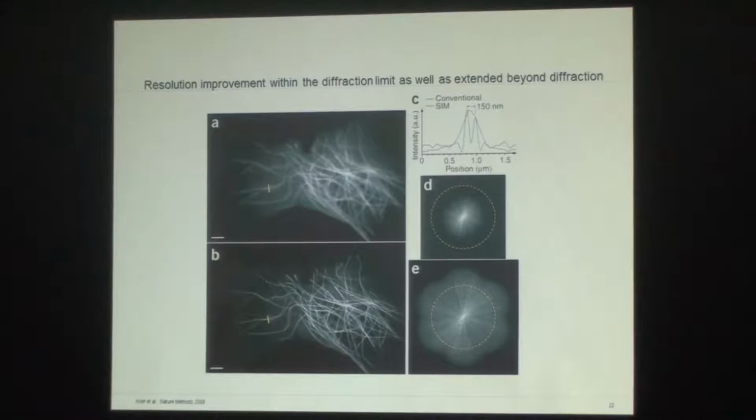So basically, once you collected the information and you make the calculation, there are 2 things the structured illumination does. The first thing is, in a conventional microscope, this is the theoretical limit, 250 nanometer, the circle you see. The frequency is transferred right now, and what you see in your image is not even filling the conventional diffraction limit.